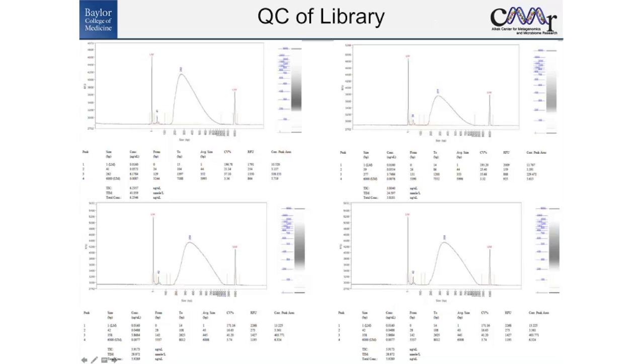So I will tell you our first run through with some of the samples were diluted in TE, which inhibits the tagmentation reaction. And so the bulk of our fragments were around 1 kb, with some down on the lower end less than 100. And so that would bias that sequencing to those small fragments. So you really want to QC in some fashion, either with an FA or a bioanalyzer, prior to committing those to the sequencing pool.